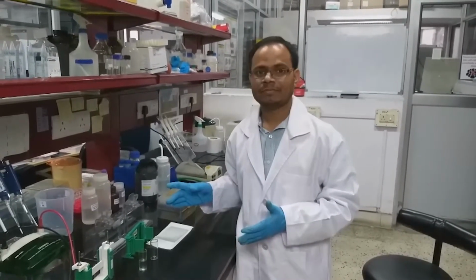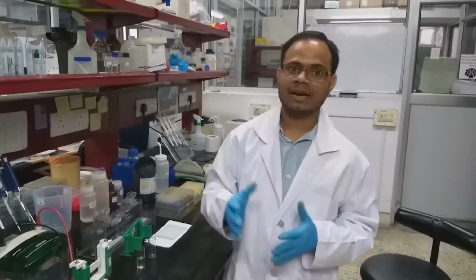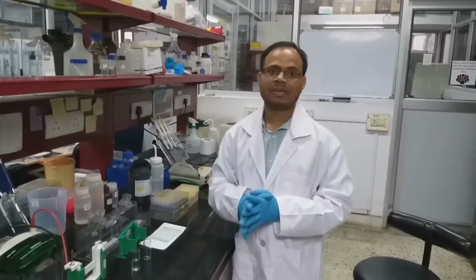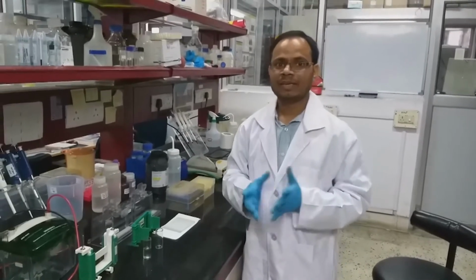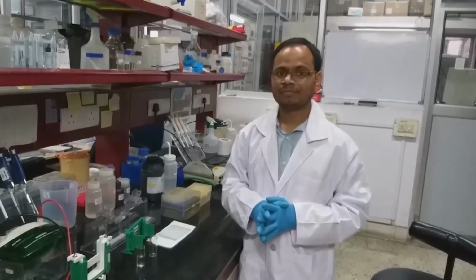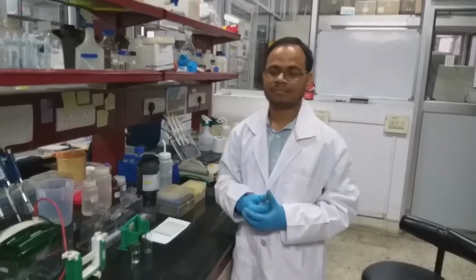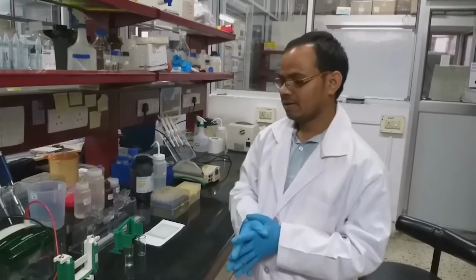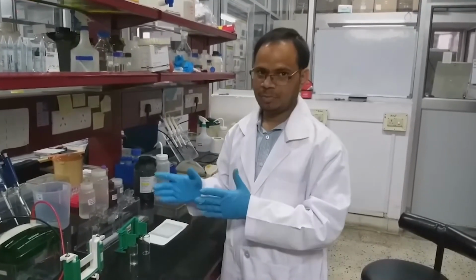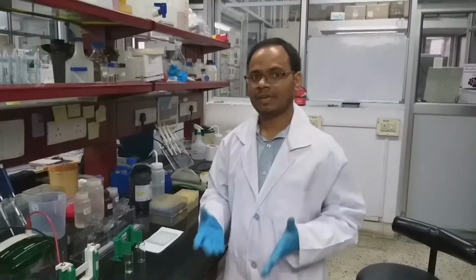After solidifying, we have to prepare the stacking gel. The stacking gel has the same composition, but we can say it is diluted. It contains pH 6.8 Tris-HCl and the remaining components are the same but in lesser quantities. After preparing the gel, we load the marker and the protein, which is denatured at 100 degrees Celsius for 3 minutes.